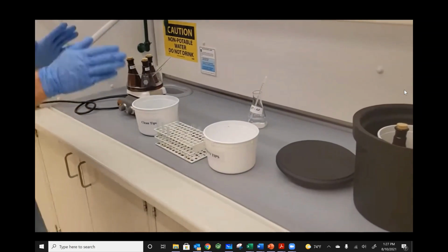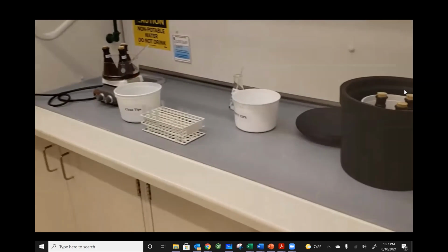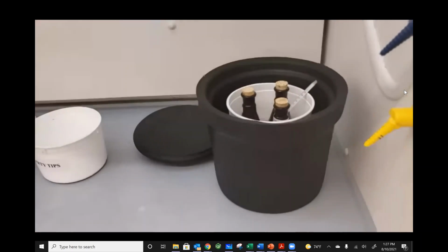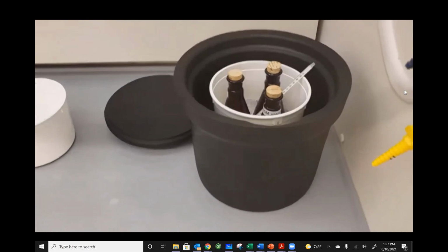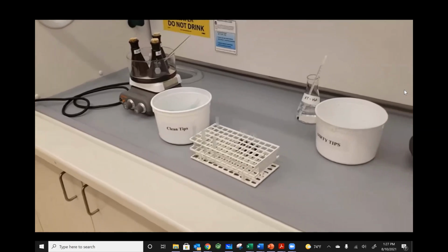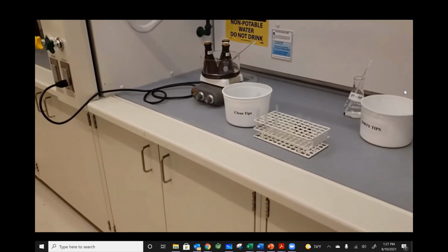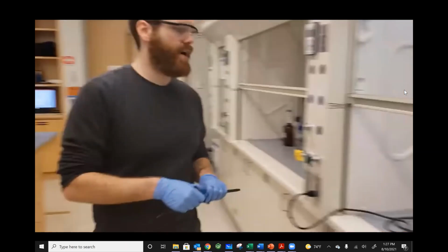So we're going to first start with our cold water trial, I think. No, we'll keep it consistent. He wants us to do the cold trial. So we will instead do 1-4, which is our hot water trial.